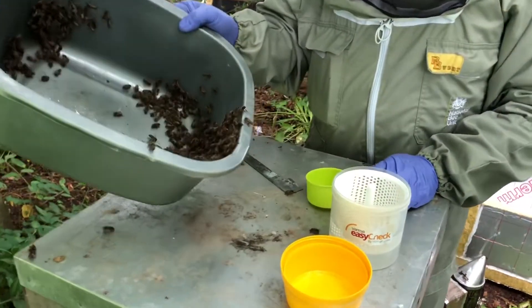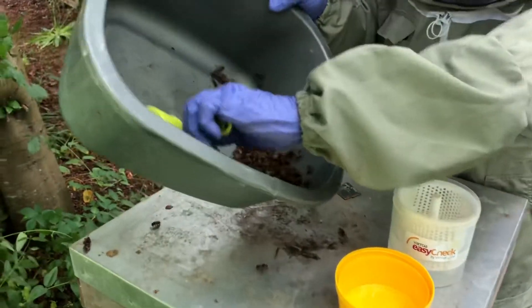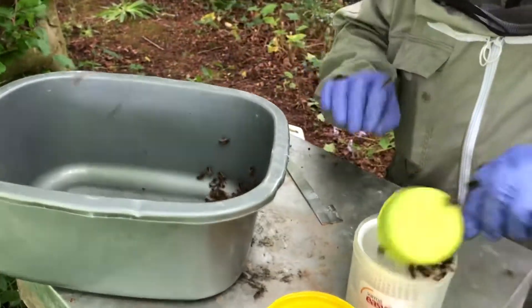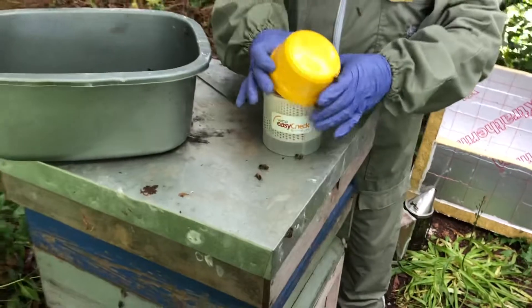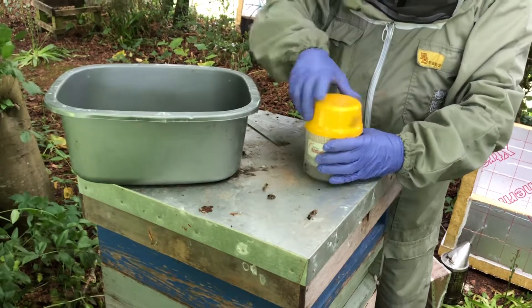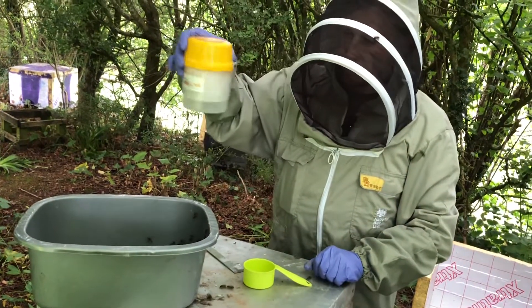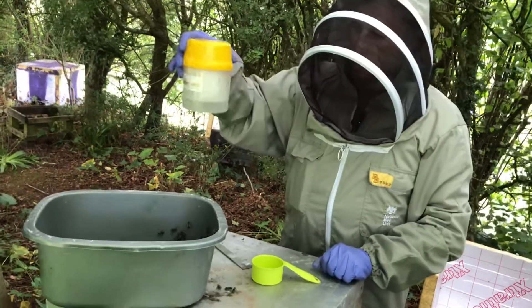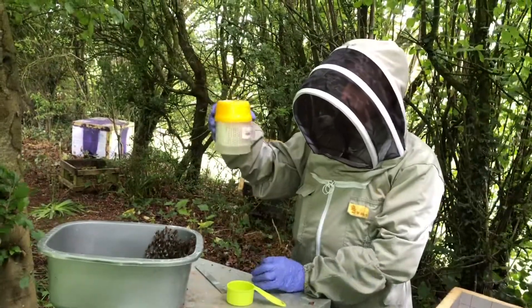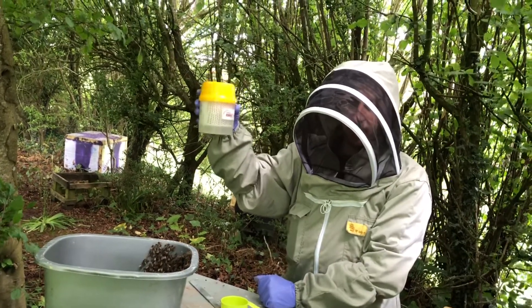I'm going to knock the sample of bees into the corner of the bowl, get my scoop, level it off, put the bees in, put the lid on, and give it a shake in a swirling motion. This should be done for one to two minutes. I've finished shaking the bees — we'll go out into the sunshine and count our mites.